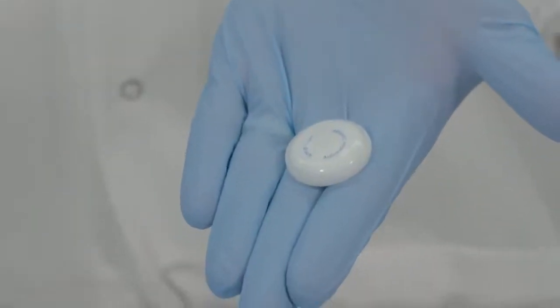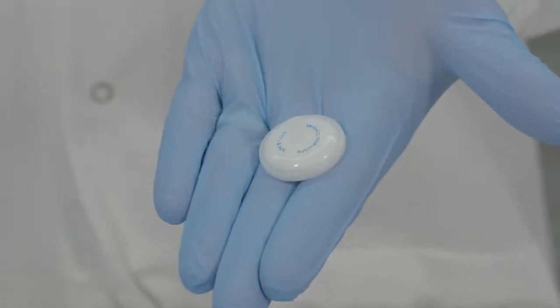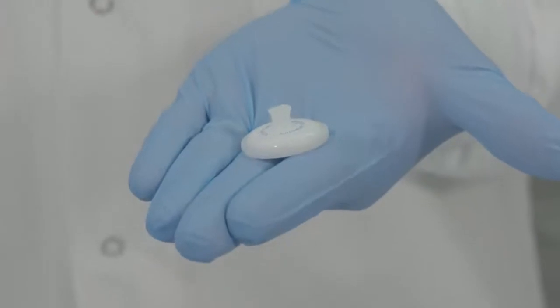For 25mm automation compatible Millex filter, having a domed housing on the inlet side does not support the membrane fully.